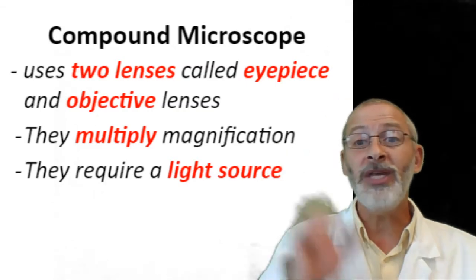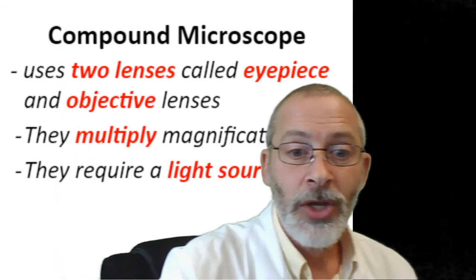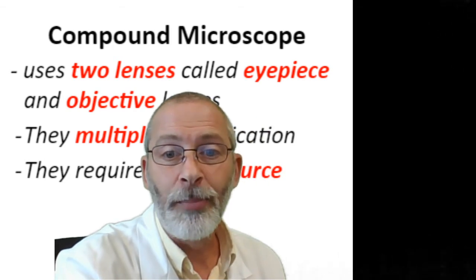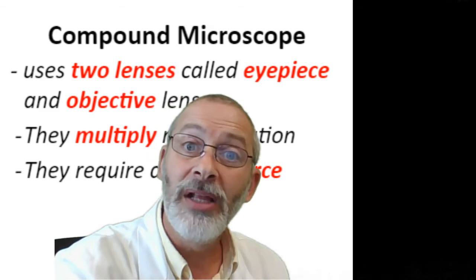And because they zoom in so much, they require a light source. So let me show you an example of a compound microscope in the lab. Join me in the lab.